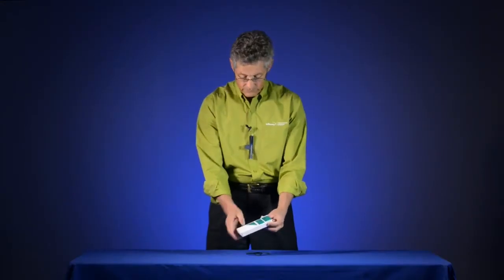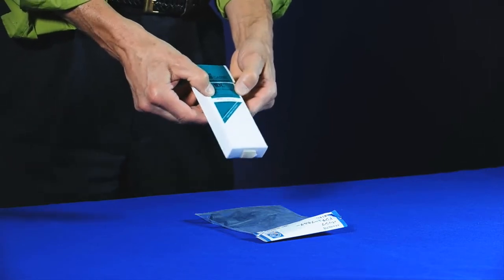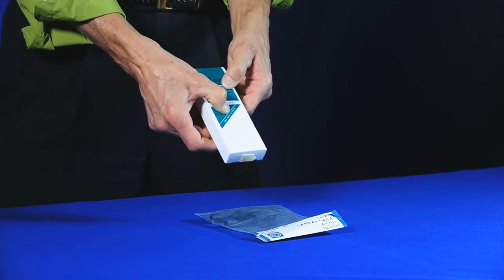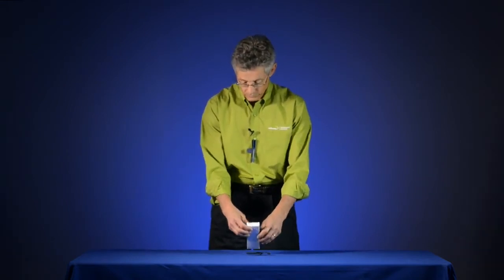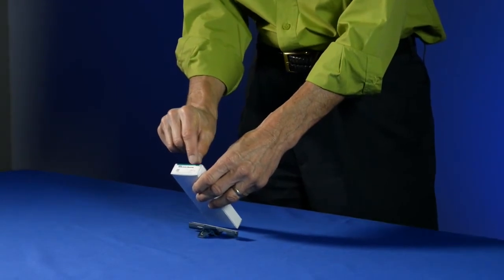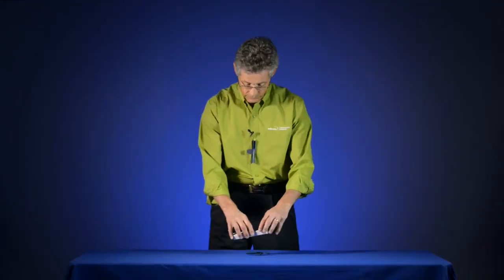When you get a box of Dositubes, you're going to notice a couple of things. There's a QC number on the front, which refers to the lot number that is manufactured. It'll give you the range. It says store below 10 degrees Celsius because these tubes like to be kept cool and dark. And you notice also on the back side, valid until January 2014. So every box will be unique or individual with respect to those numbers.